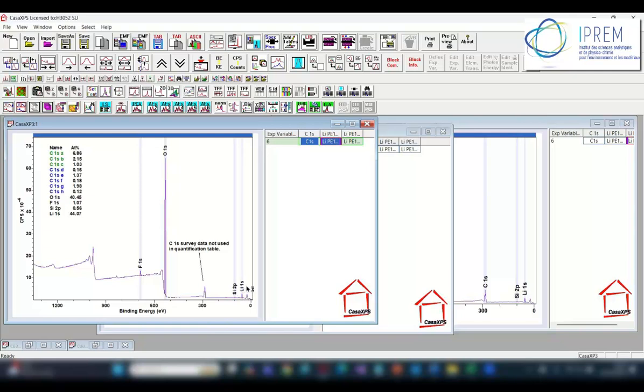It will take a long time to measure the lithium, and actually you don't have time necessarily with XPS because samples change the longer you measure. So it's not always an option to carry on measuring to get the signal to noise that you want.